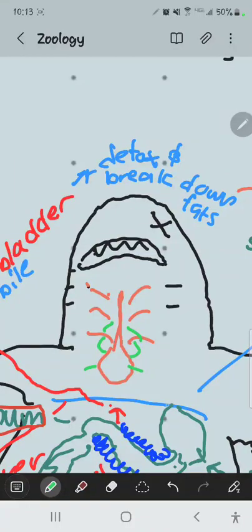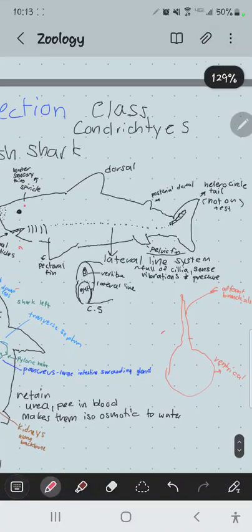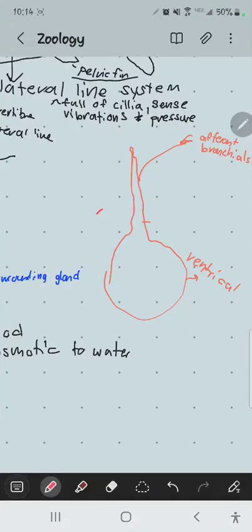Like when you drive out 299 towards Reading, you have the Highway 5, 299 overpass, and all those on ramps and off ramps. That's what the sinus venosus is. This is where the jugular veins, the cardinal veins, the lateral veins, and the hepatic vein all dump back into the sinus venosus. So it's just basically a bag that collects all of it.